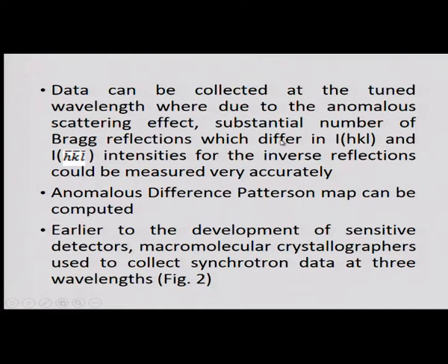So, here you can ask me why there are two techniques, multiple wavelength anomalous diffraction and SAD. Initially, the detector technology was not that great. So, to overcome the ambiguity, people used to collect data at 3 wavelengths, which I will show you from the graph. But later on, the detector technology has improved a lot. The intensity difference, even if it is less than 0.5%, you can measure accurately. That is why people are jumping to single wavelength anomalous diffraction, SAD.